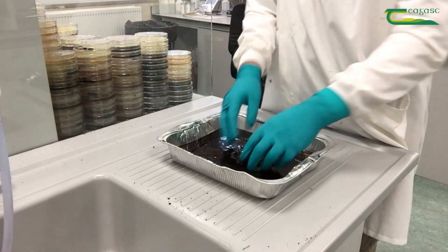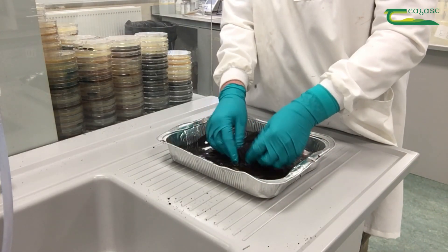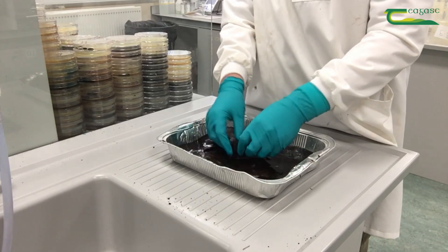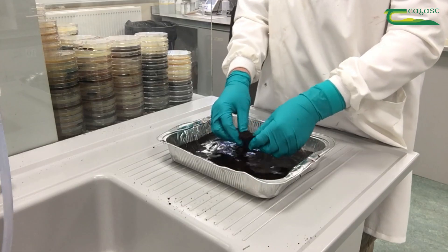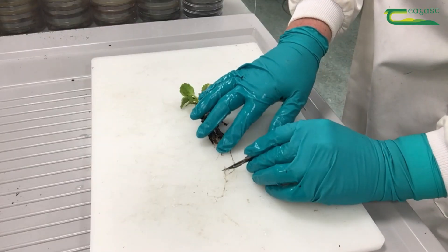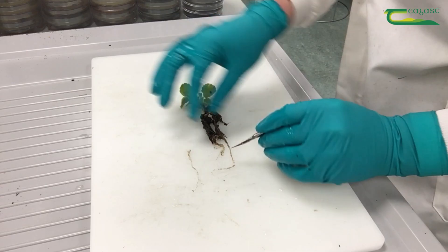In this particular case we'll be testing the root material. We start by removing as much soil as possible from the root ball by washing it in tap water. This allows us to see where any lesions and damage might be. Choose several root pieces which show signs of damage.